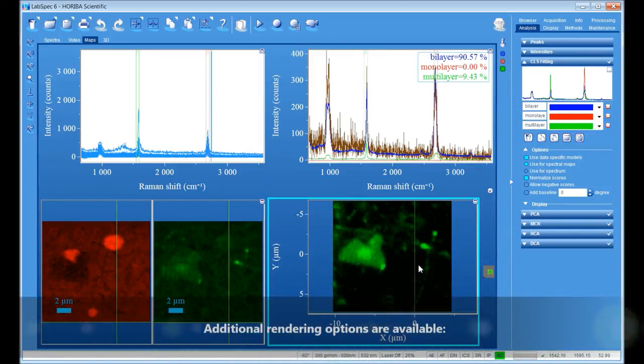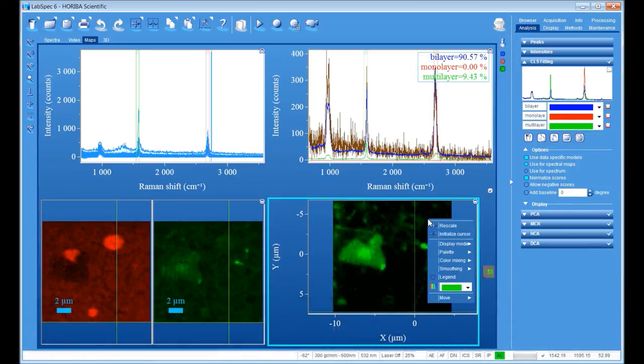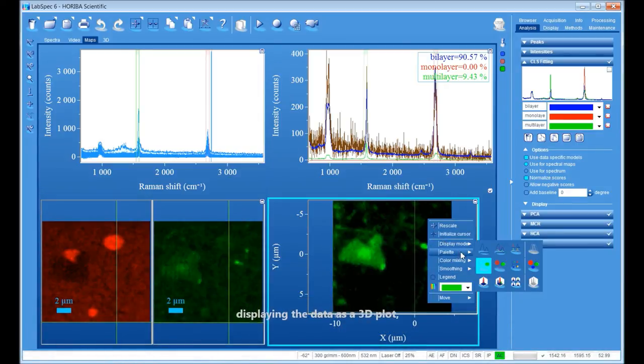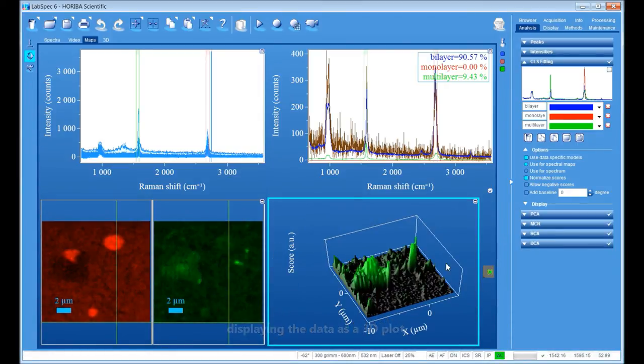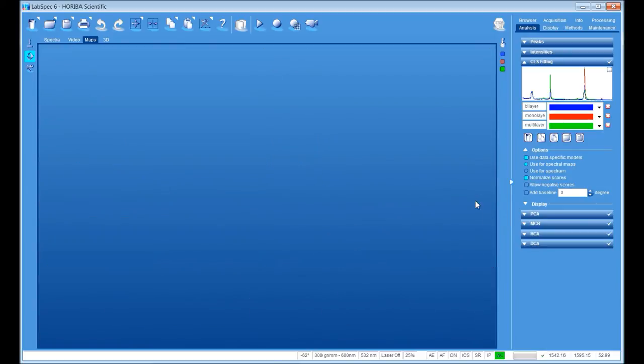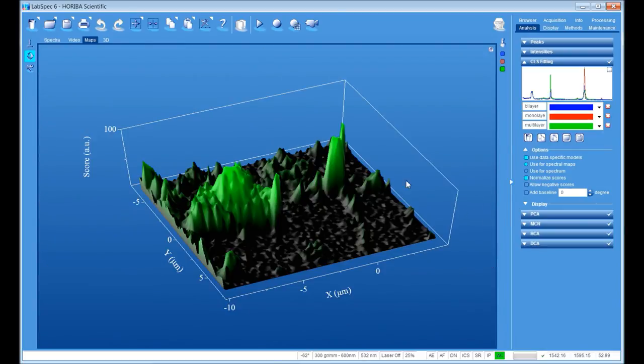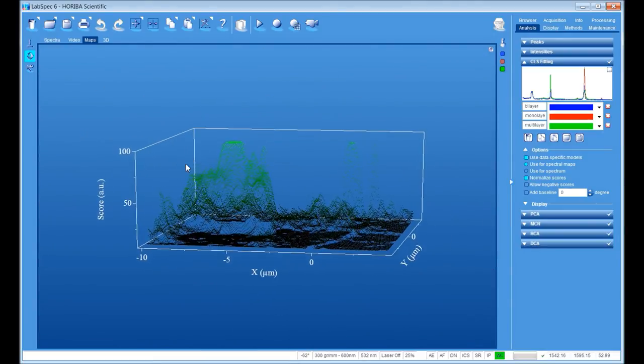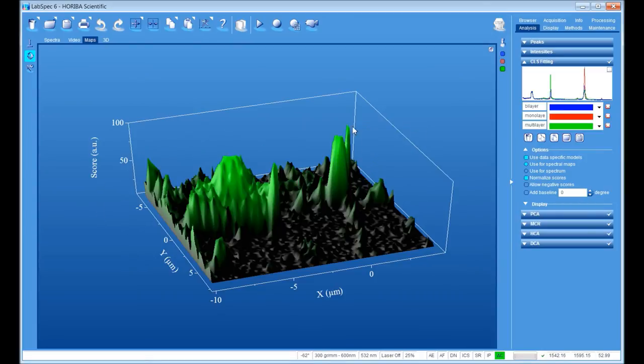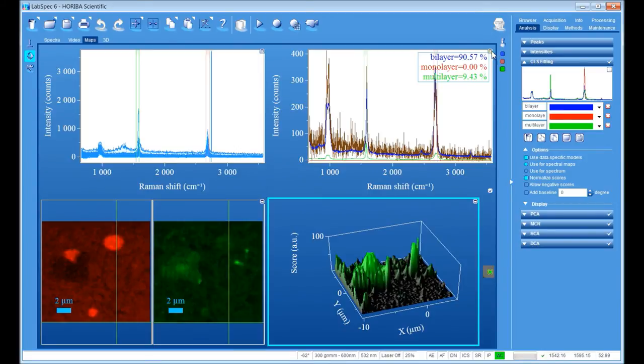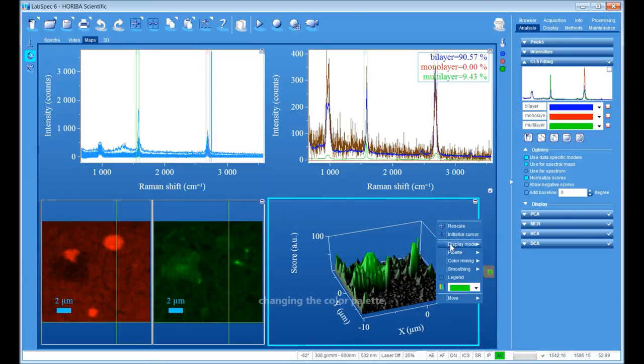Additional rendering options are available, such as displaying the data as a 3D plot or changing the color palette.